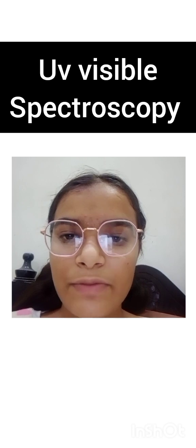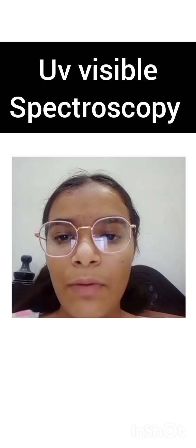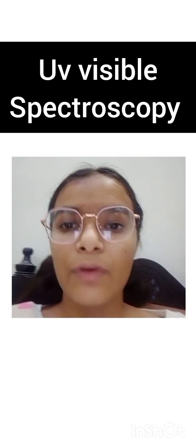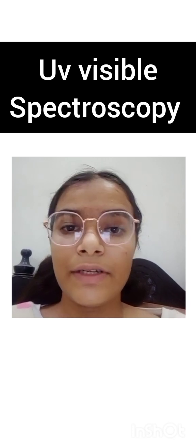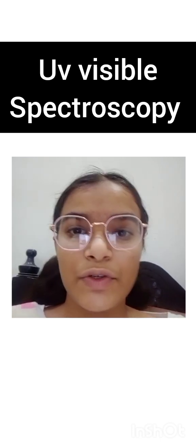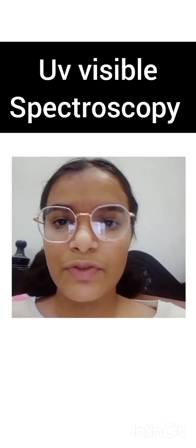E is the molar absorptivity, in liters per mole per centimeter, where M is moles per liter. The molar absorptivity, formerly called the extinction coefficient of the compound, is a constant that is characteristic of the compound at a particular wavelength. Now we will discuss the molar absorptivity range. It may be very large for strongly absorbing compounds, more than 10,000, and very small when absorption is weak, like 10 to 100. No absorption gives E equal to 0.